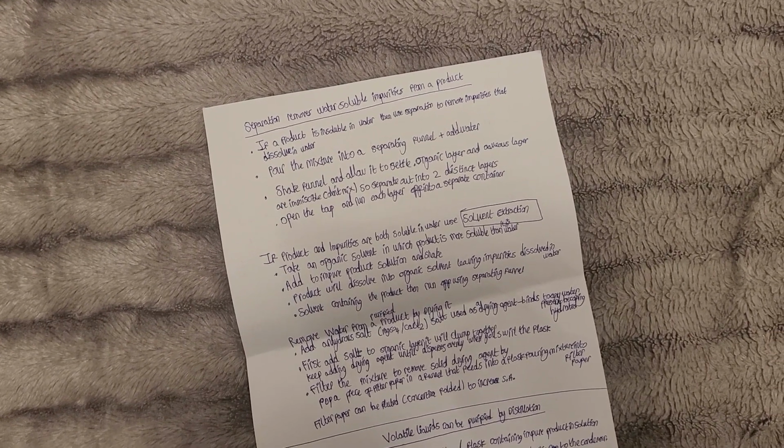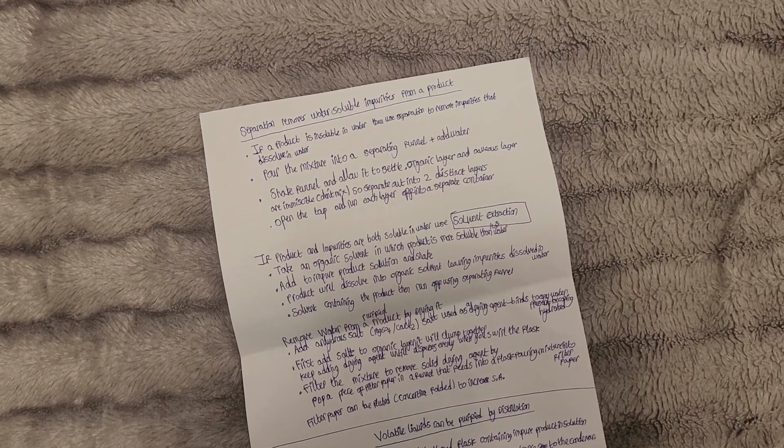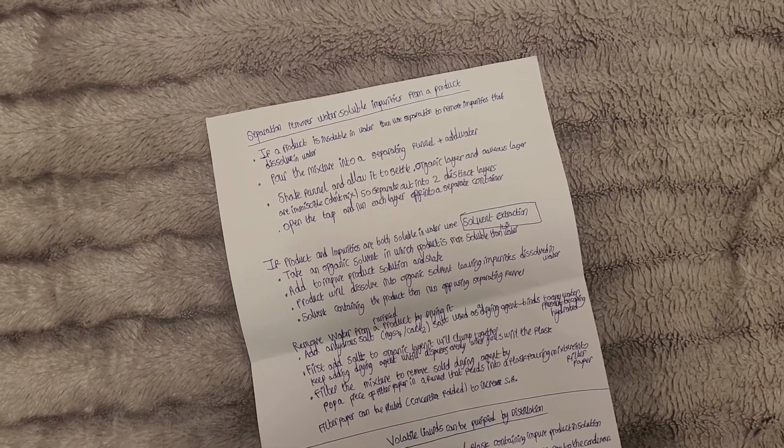The organic layer and aqueous layer are immiscible, they don't mix, so they separate out into two distinct layers. Open the tap and run each layer off into a separate container.